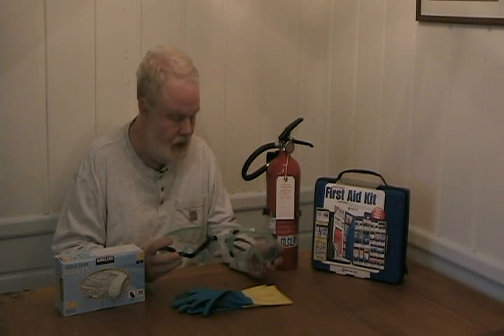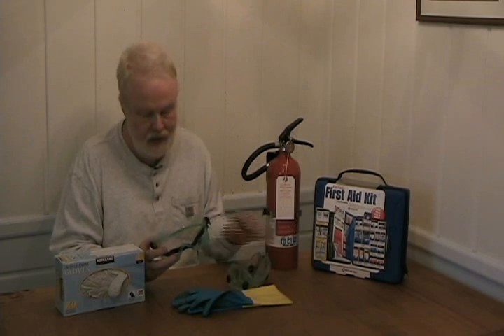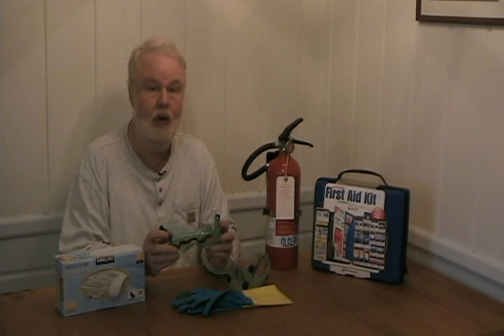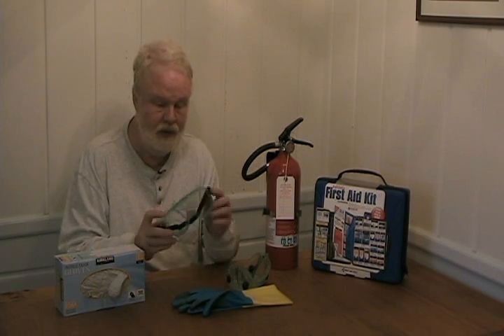I don't know if you can see the details on the video, but these two goggles appear very similar. The difference is these goggles have many rows of tiny holes poked in them. They're intended to protect only against impact hazards such as using a grinder or power tools of other sorts. They are not lab safety splash goggles. Anything that splashes on them can run right through all of these tiny little holes and into your eyes. The first thing to do when you look at a goggle is to make sure that it is a laboratory splash goggle.